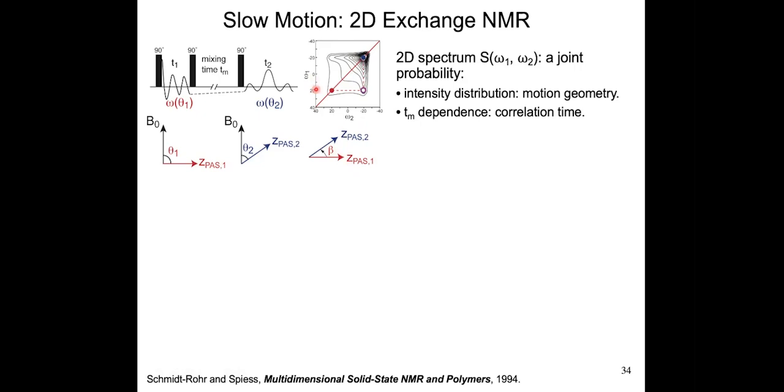You can imagine the kind of spectrum you should expect to see. Don't worry about site resolved nature. Imagine you literally have one type of spin system with its corresponding powder pattern. Then you would have omega-1 and omega-2 axes, both having powder patterns.